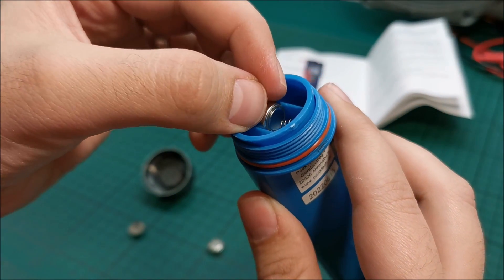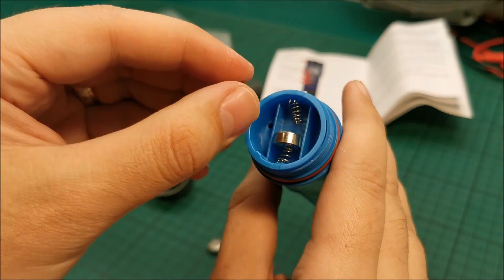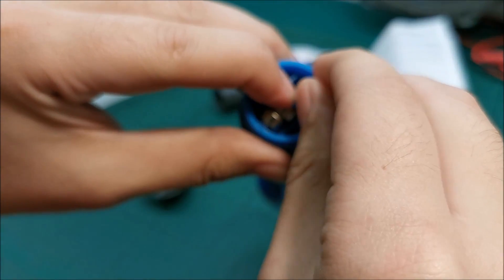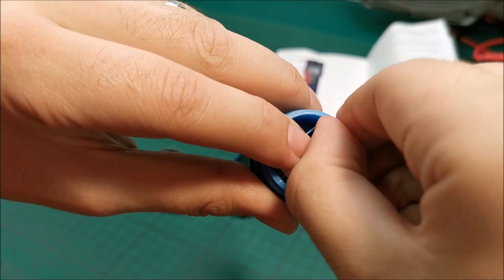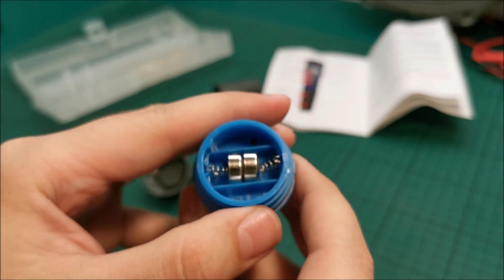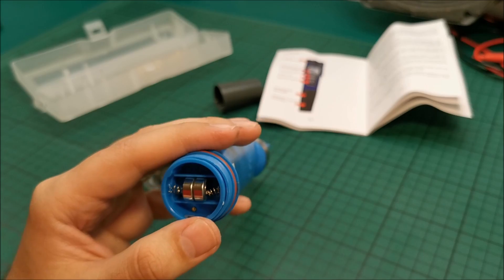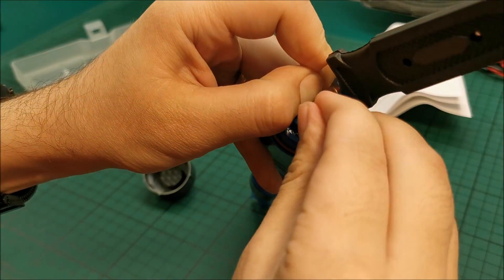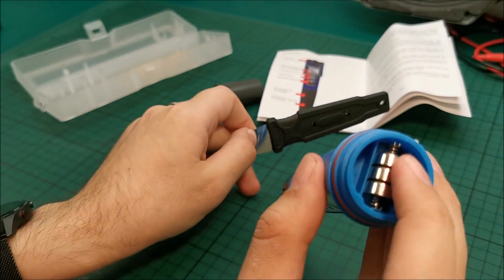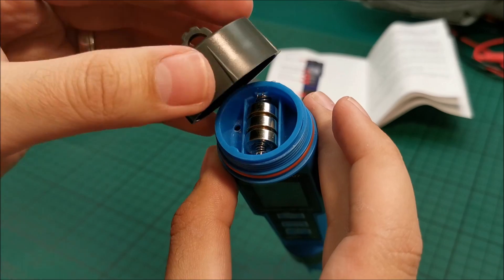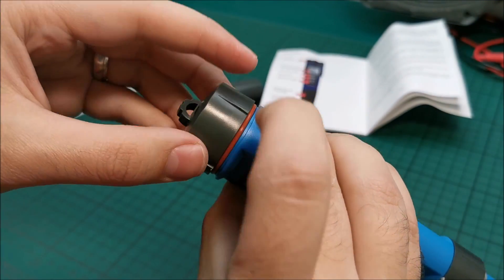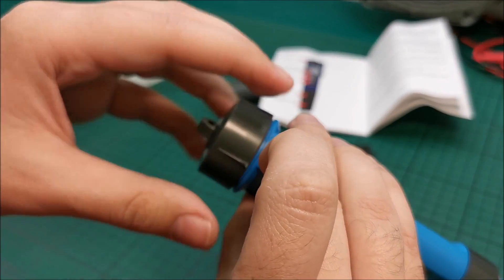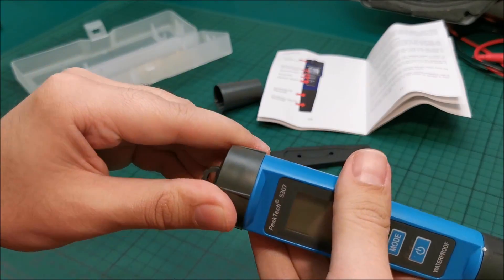Batteries again, back to the positive. Do not short them, that would be really bad. Push them a little bit. And yank. Think this little guy is kind of a bit annoyed by me at this point. And I might be having a bit of trouble with it. Let me think of something to keep it apart from the batteries. Yep, that was it. And we're in. And now if we put this thing in here, it's holding the batteries in place. It's also sealed, as you can see from the orange seal. Just to take one more look, yep, in place. Nothing moving anymore.